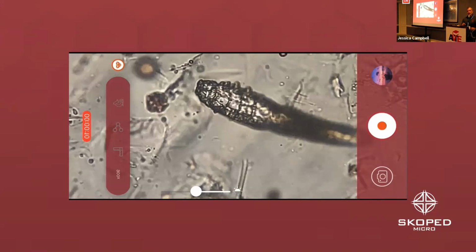I'm going to send you a link, or you send me a link, and I want to look at a couple things. And she said, I could do that in real time in 10 minutes. Yeah, you could do that. She said, oh my gosh, because you may have taken a picture of something and need a little bit bigger sample, or need to see a couple more varieties of that. So yes, there's no doubt that's going to be a thing if you can make good slides.